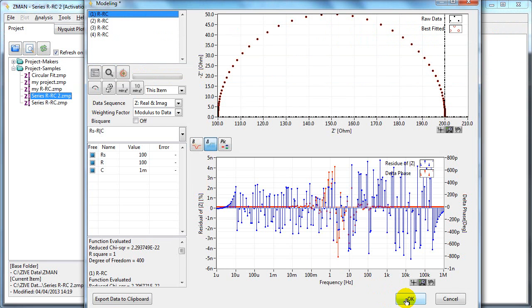If you click OK at this point, this fitting model will be kept with the data. If you click cancel, it will be discarded.